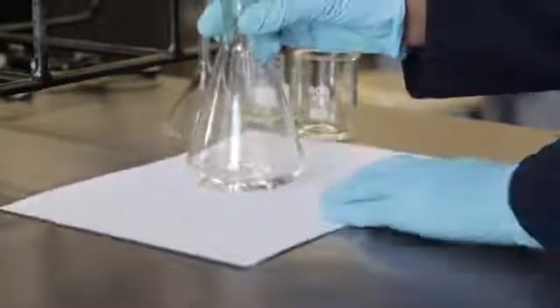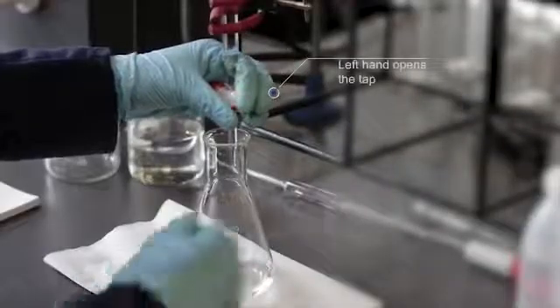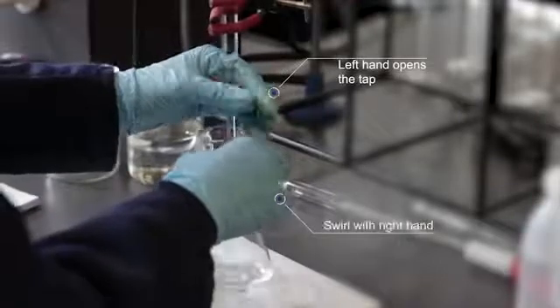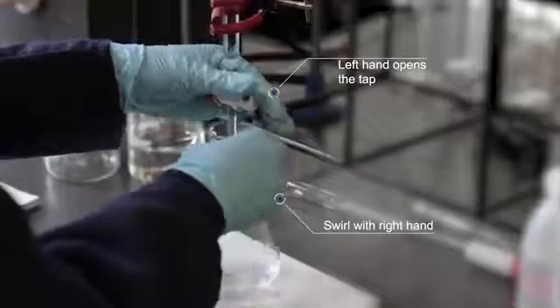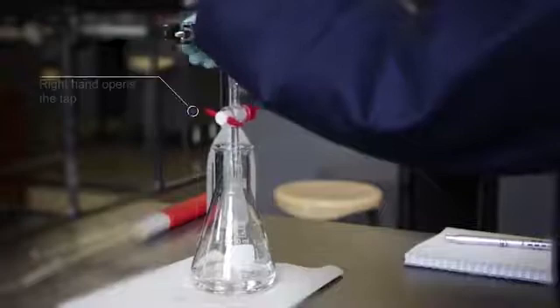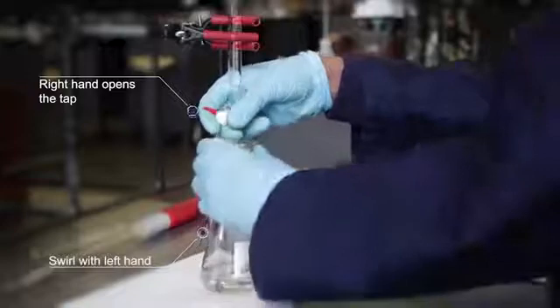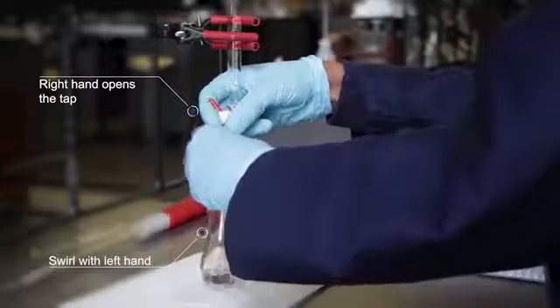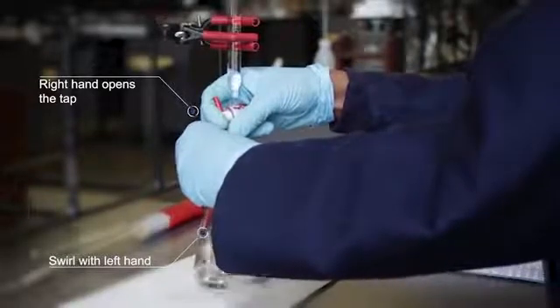To better observe the color change of the indicator, a plain white piece of paper is placed under the conical flask. For right-handed individuals, the burette tap will be handled using your left hand, while the flask is swirled with the right hand. However, for left-handed individuals, the burette tap is handled with the right hand and the flask swirled using the left hand. In this case, the left-handed individuals will have to reverse the burette to accommodate their titrations.